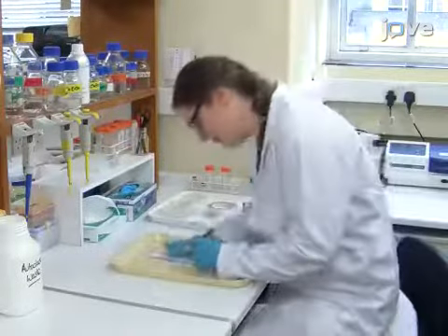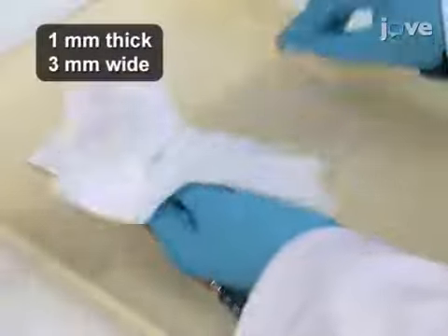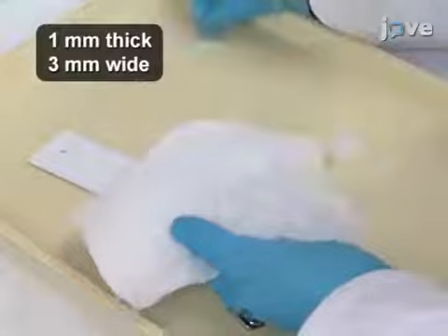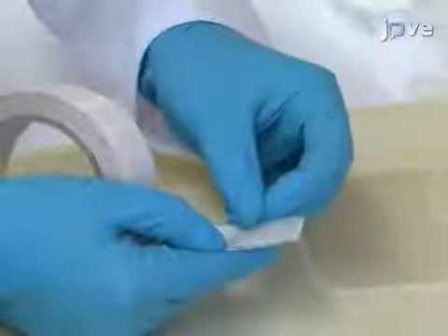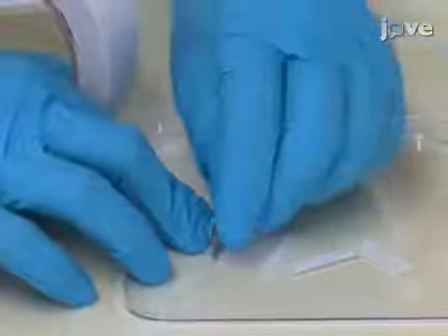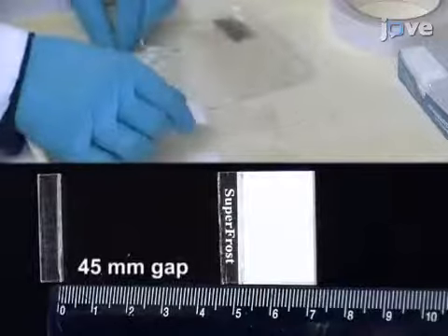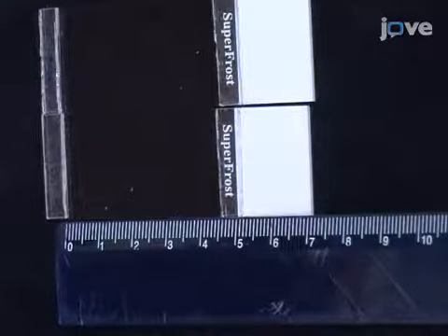To begin, use a glass cutter to make 3 mm wide glass strips from a 1 mm thick slide. Then, with cyanoacrylate glue or double-sided tape, secure the strips approximately 45 mm apart across the width of a new slide. Make an extra slide with the same dimensions to serve as a mold.